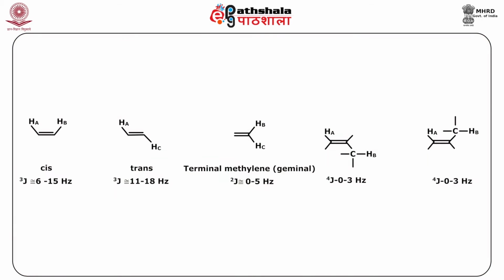There may be 3 different types of spin-spin interactions in alkenes. The splitting patterns of both vinylic and allylic hydrogens is quite complex. The hydrogen atoms attached to a double bond are rarely equivalent and hence they couple to each other, forming a complex coupling system. Further complications may arise due to the allylic coupling.